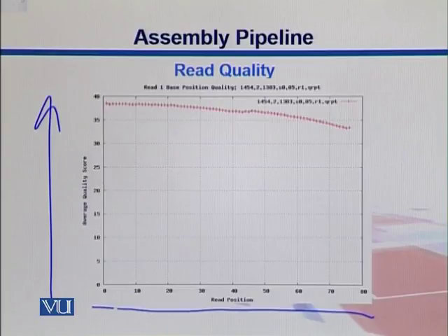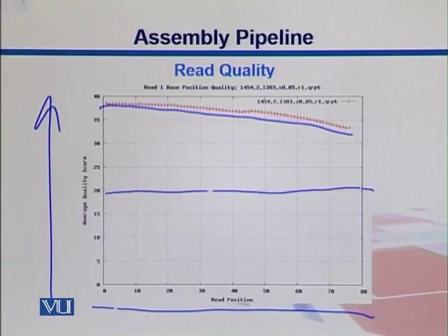Starting from the left-hand side at nucleotide number 1, the qualities are really good, close to 40, and then they keep decreasing, but that is quite expected in Illumina: towards the 3' end of the reads the qualities are slightly lower, but they are still higher than the threshold. Normally in our experiments the threshold is 20, so any score above 20 is good.